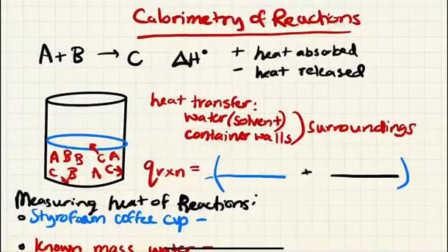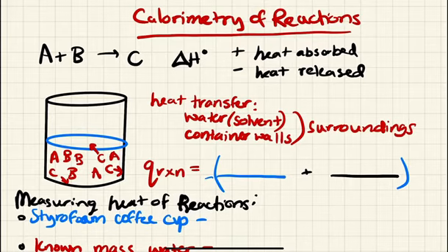In this experiment, we will look at the overall heat of formation of certain metal oxides, and this will involve the measurement via calorimetry of specific steps involved in the overall reaction. Specifically, those steps will be the oxidation of the metal to its cation form, and also the reaction of the metal oxide with acid so that we can investigate the heat involved in the metal oxide reaction.